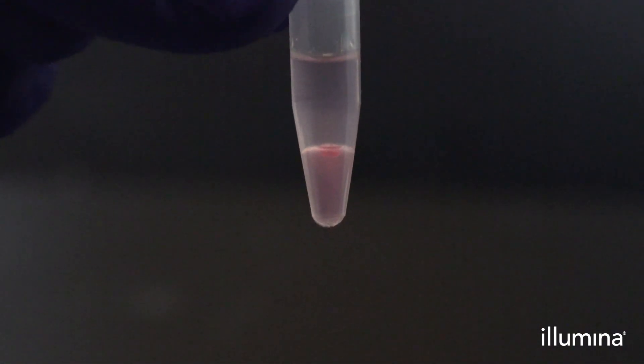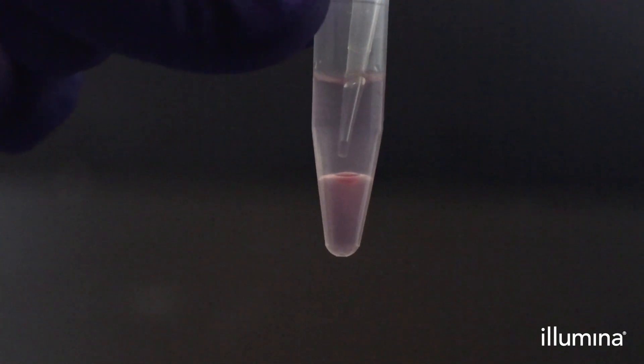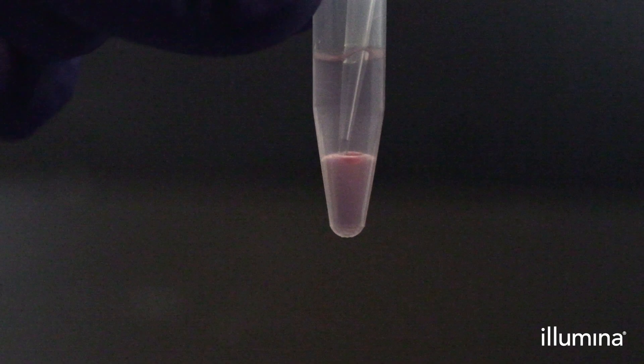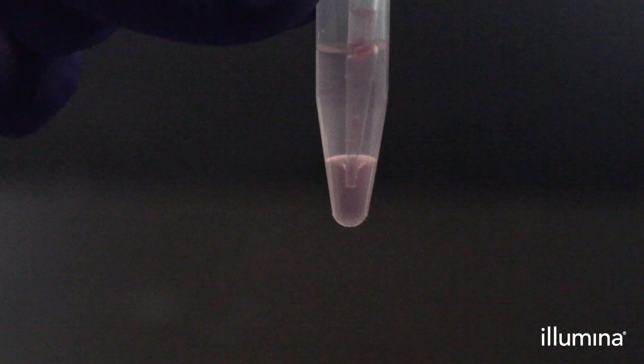After spinning down your samples in a benchtop minifuge for 5 to 10 seconds, aspirate all of the bottom pink waste phase. With a pipette set to 70 microliters, begin with aspirating out the bright red dot at the interface before continuing with aspirating the rest of the waste.